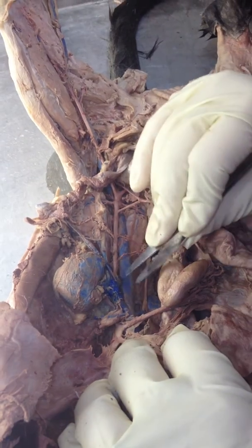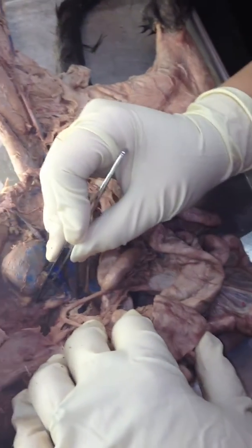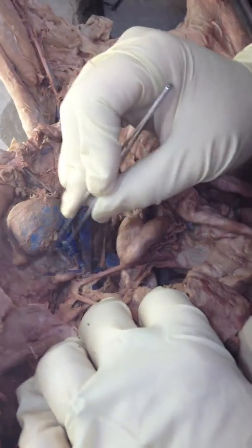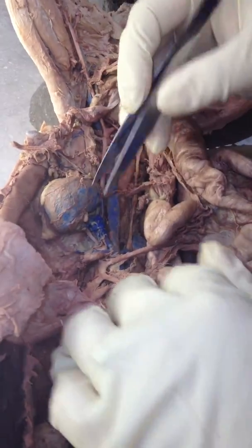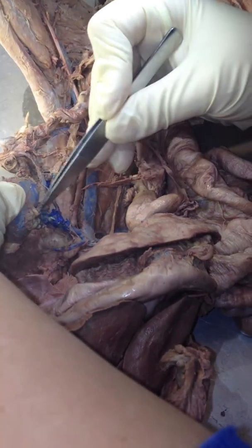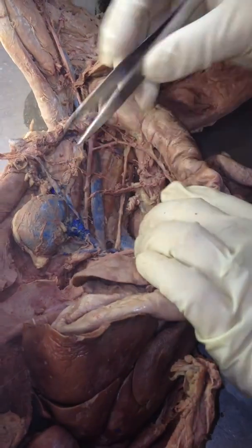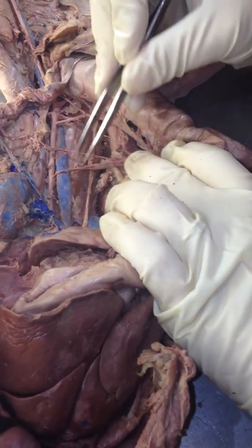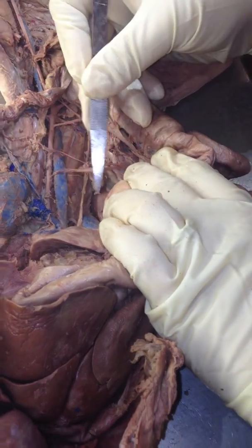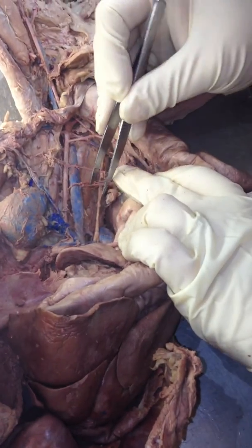Veins. Okay. Big guy, posterior vena cava. This one, adrenolumbar vein. This one, renal vein. That guy, genital vein. And there is another one coming off that didn't stain terribly well, but there it is. You can see it coming off of the vena cava. It just didn't stain.